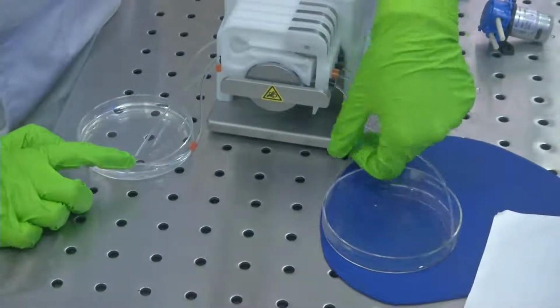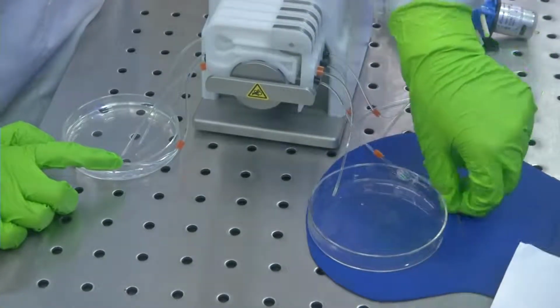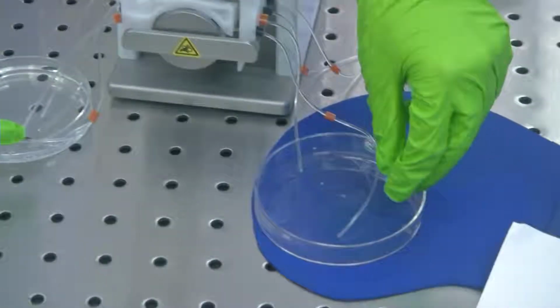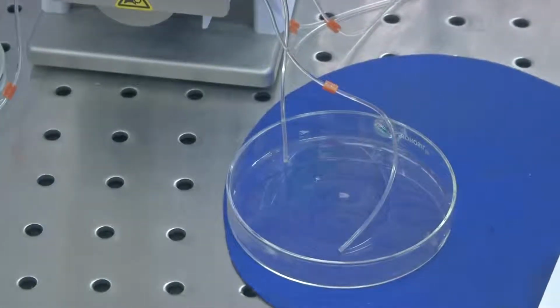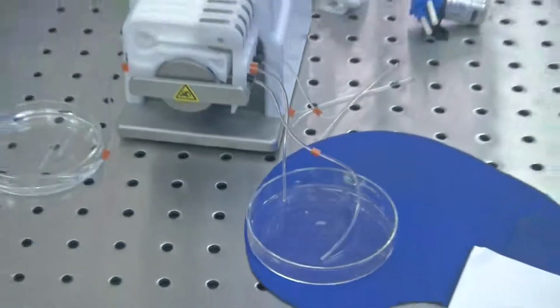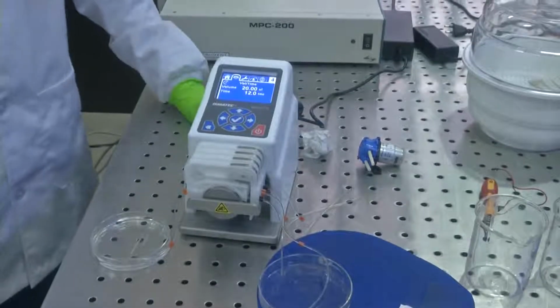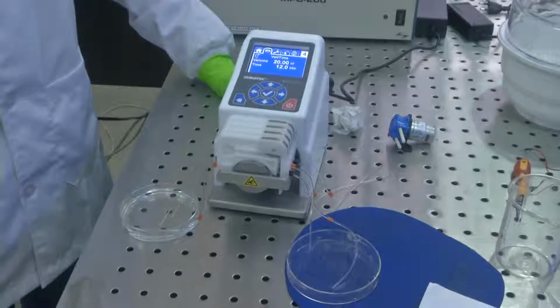Let us see the other setting. As you can see, there are droplets. Let us check what is the setting in the 4th cassette. So, this is 20 microliters. So, this is a higher volume. 20 microliter of fluid should flow across the source to the sink in 12 seconds.